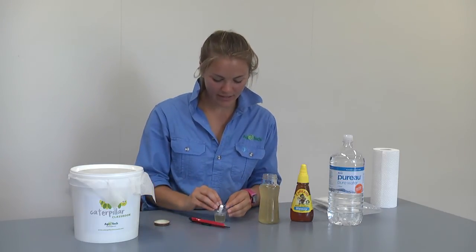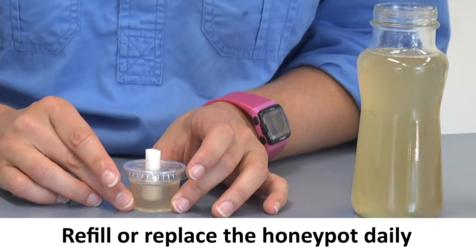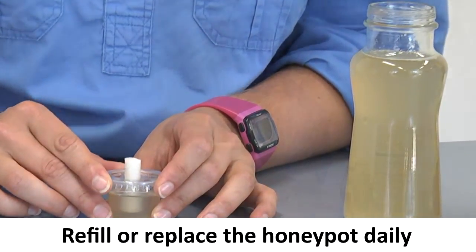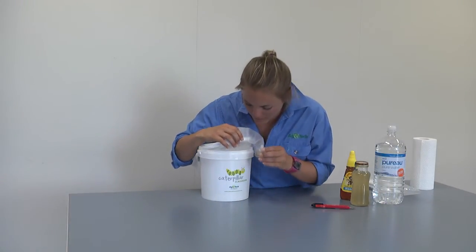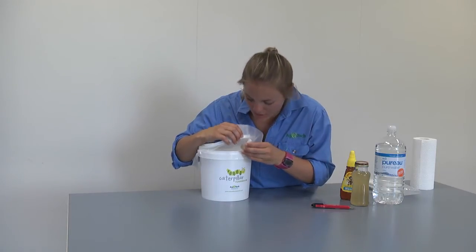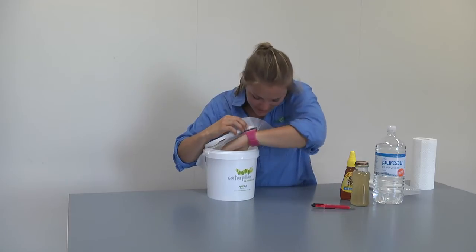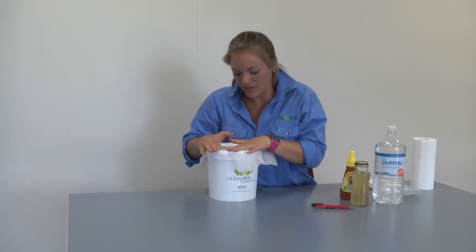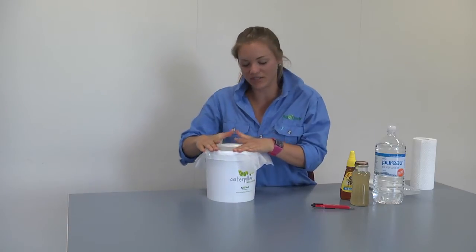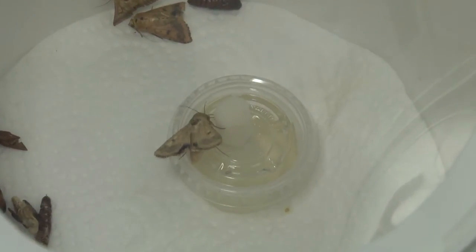Place the lid back on top. Keep your remaining honey solution in the fridge and refill your honey pot as needed. Once you've prepared your honey pot, place it inside the bucket, being careful not to let any moths fly out as you do this. Once it's on the bottom of the bucket, make sure to secure your lid back down so your moths don't escape.